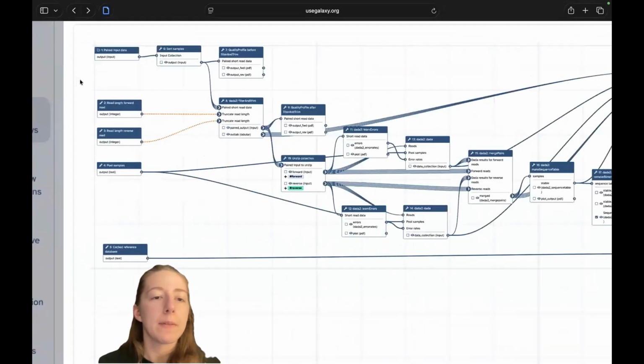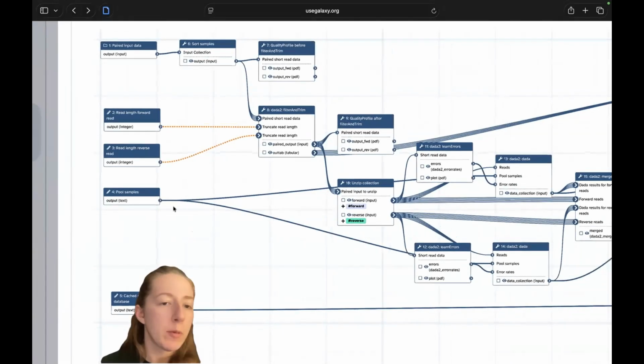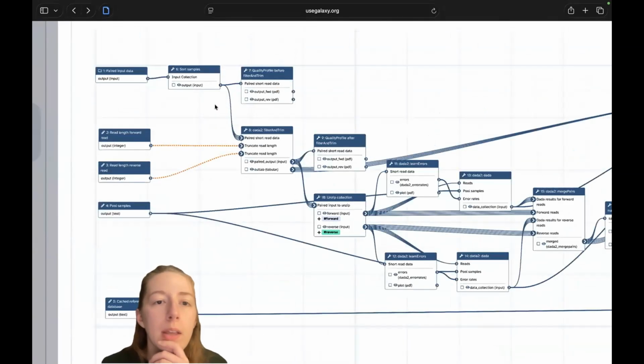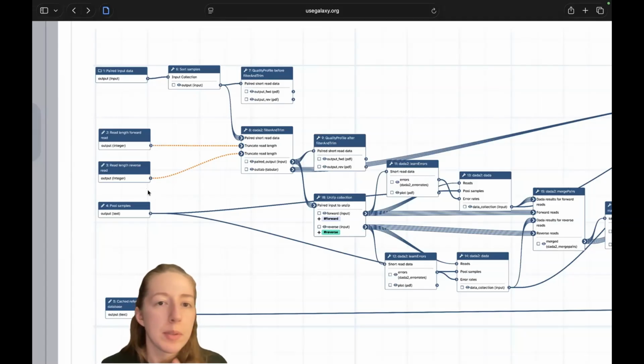They basically have a few steps here that will be responsible for adjusting. However, each of these steps, most of them are adjustable. And so what we're going to be doing is importing our FASTQ files and making sure that the software recognizes their paired reads and defining then the length of the sequence that we want to keep and how much we want to trim for both the forward and then the reverse, and if we want to pool samples.